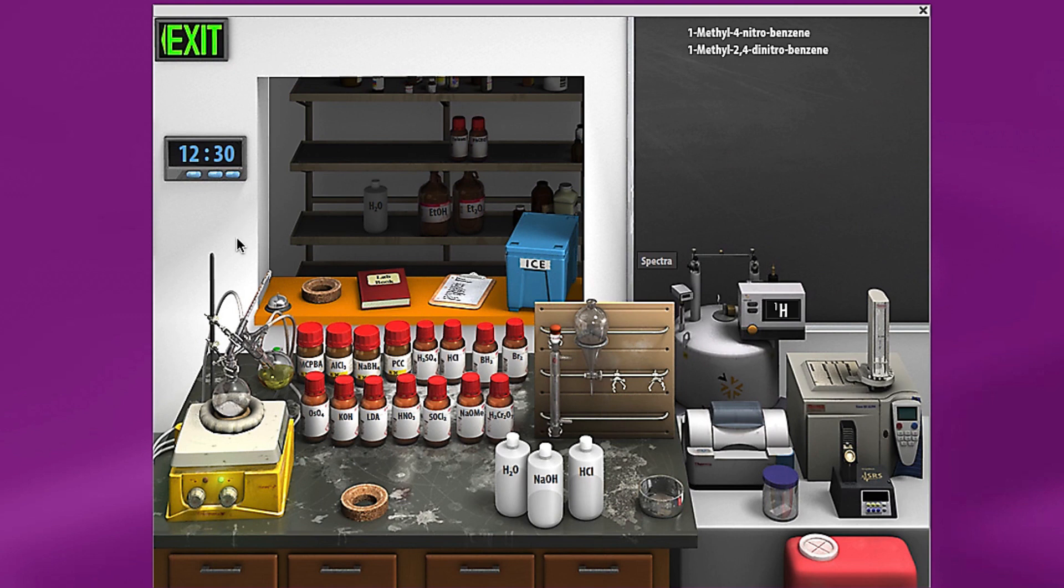Okay. So now we have all of our two nitro here all separated. And we have our other two remaining here still in the flask. And so that's how you'd go about doing a separation.